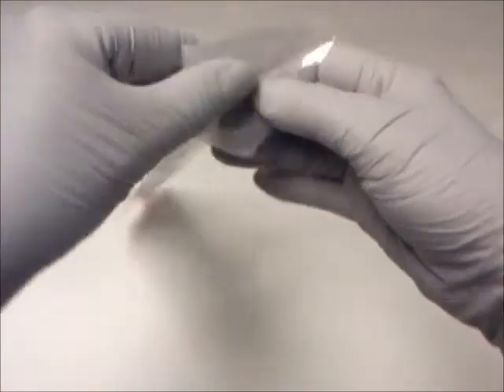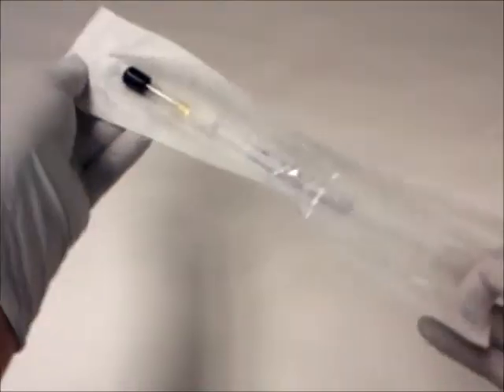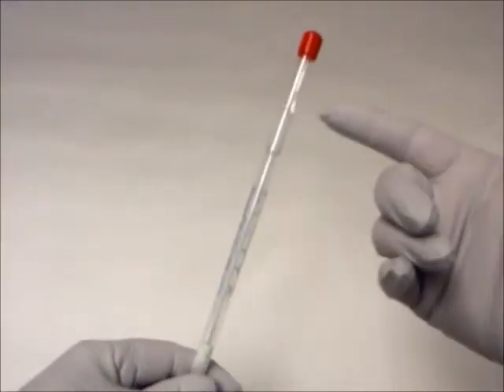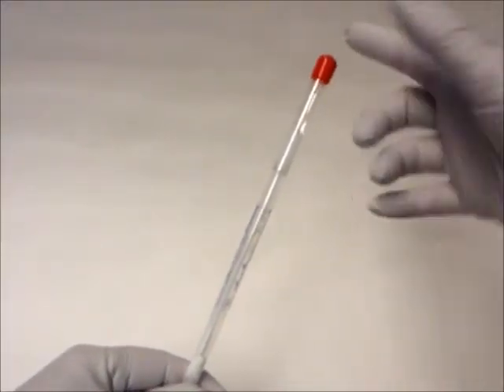First, remove the swab from the plastic protective sheath by grasping the top of the swab connected to the area with the red cap. Twist and pull out.